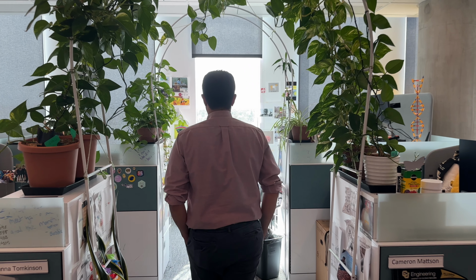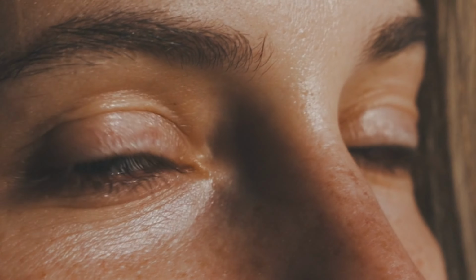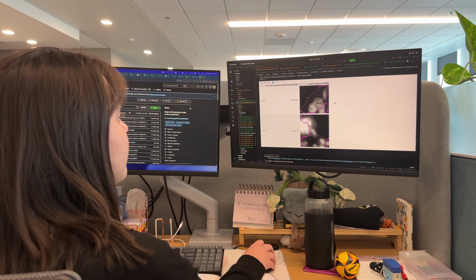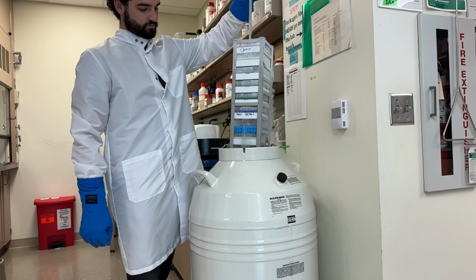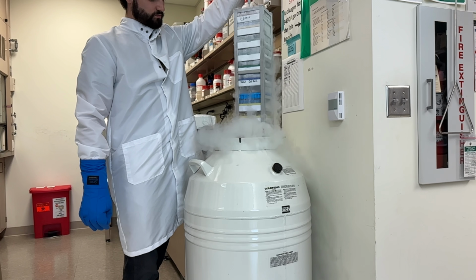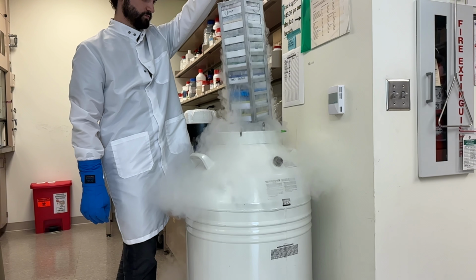Cells are the building blocks of life. In our research, we've identified that disease cells look different than healthy cells in many contexts. We developed a technology called image-based profiling to study cell morphology. We develop open source software for the image-based profiling technology. This allows us to analyze large-scale screening data sets that use either genetic perturbations or drugs to identify different reagents that might make disease cells look healthy again.